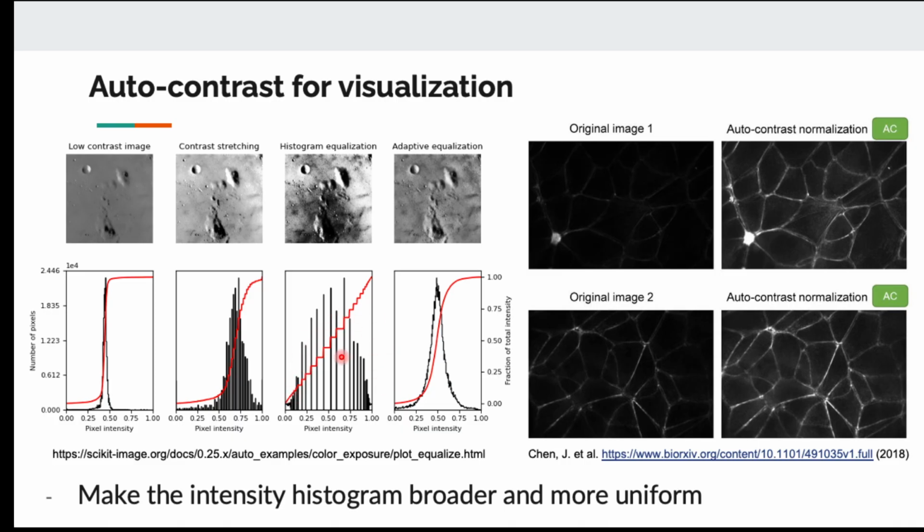These are things that usual photo processing also does. You can change the contrast of the image to be able to better see individual objects inside. You start from this original that has low contrast, but by adjusting the intensity range, how it's distributed, we are able to see better that there are multiple objects in this area.